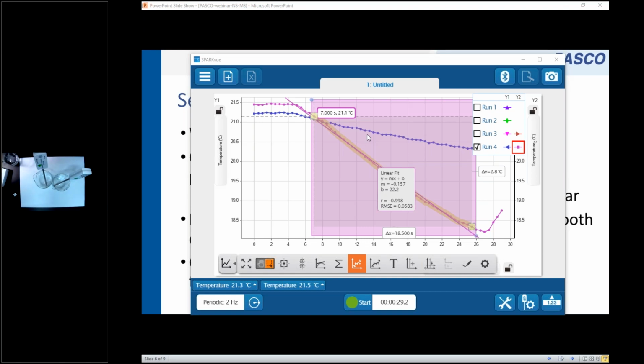Another activity you can do is grab 2 test tubes with 1-hole stoppers in them. Fill one up. Use a bike tire inflator. This has carbon dioxide in it. You can get these at any bike shop or Walmart even. And put just 1 or 2 seconds worth of carbon dioxide into the test tube. Seal it up right away. Put a temperature sensor in there.